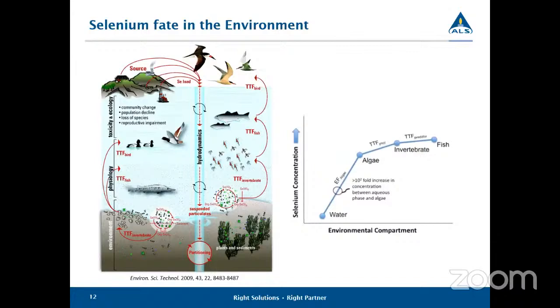Okay, thank you. It looks like we have another question. For the chromatographs, how do you know the unknown peaks are selenium species and not some other metal or contaminant?